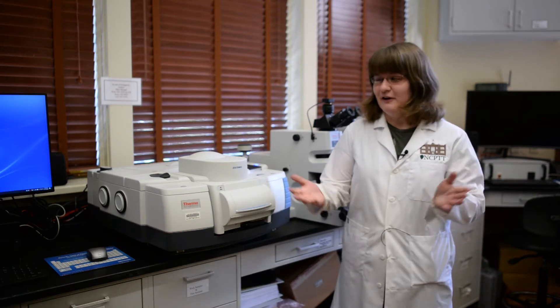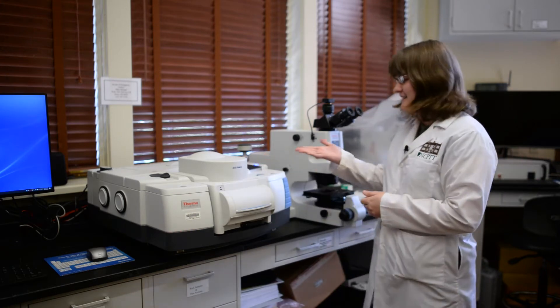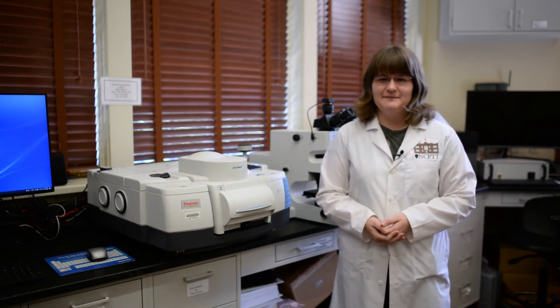Hello everyone, my name is Abigail Poe and I'm a research associate here at NCPTT. I'm welcoming you into our lab today to talk about this instrument here, which is the FTIR or Fourier Transform Infrared Spectroscopy.